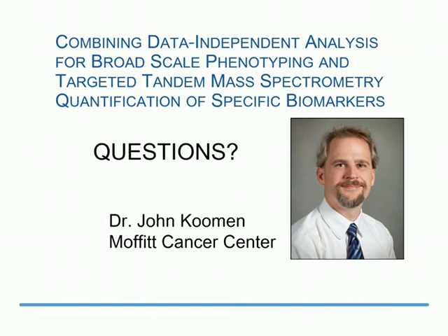If you have, say, 100 specimens in a tissue microarray, or you have somebody that's doing a number of different drug treatments, dose escalation studies, time course experiments, they want to be able to follow all of that information and generate the data in a reasonable period of time. A reasonable period of time for us would be somewhere between 2 and 4 weeks, then we're generally looking at 90-minute gradients and 2-hour total run times.